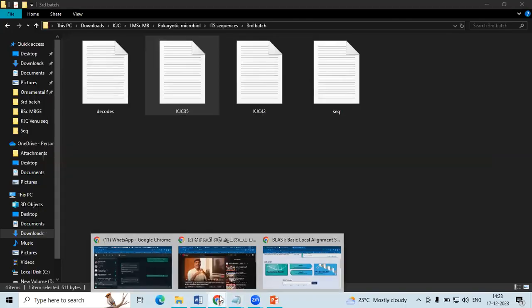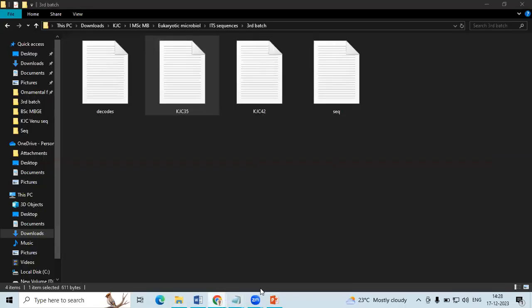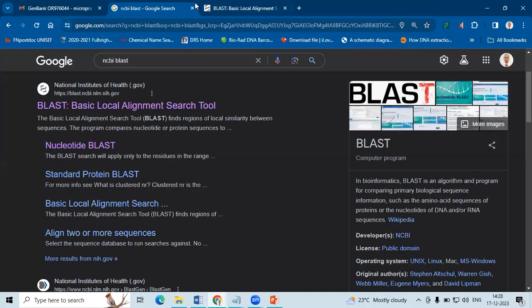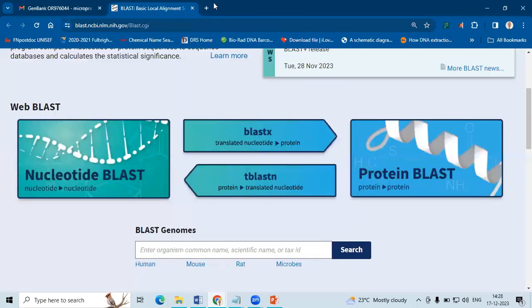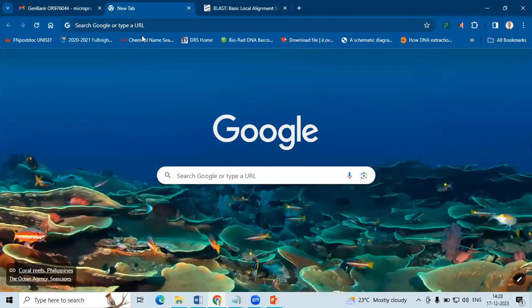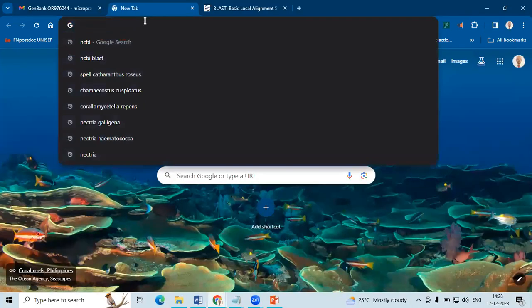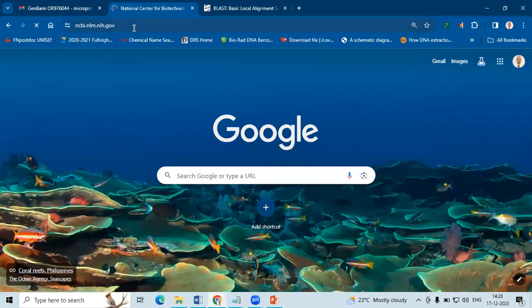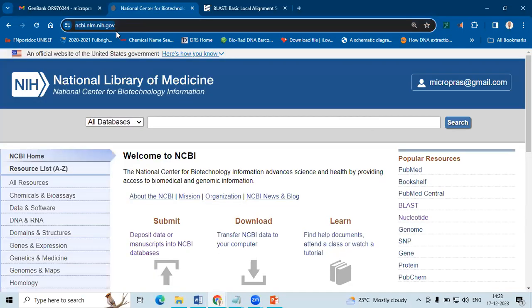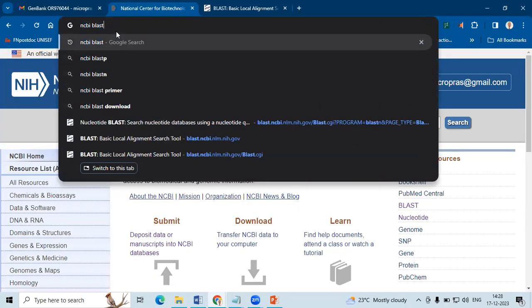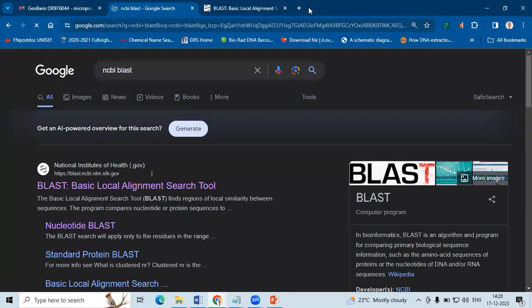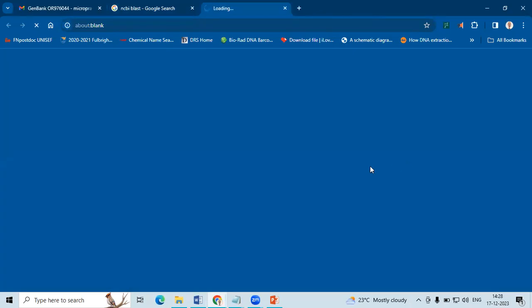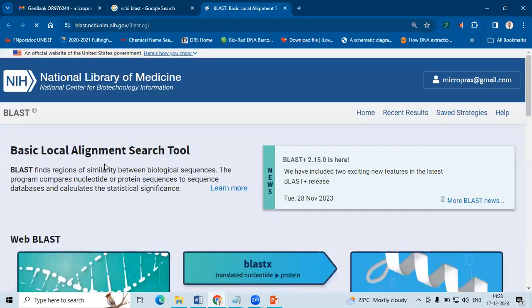So how to do BLAST analysis? Go to Google, here type NCBI. You can also type NCBI BLAST so that it will be the first page. Select the page.